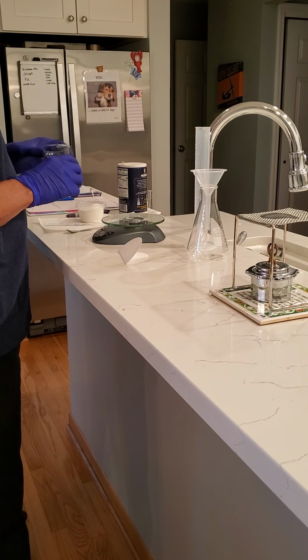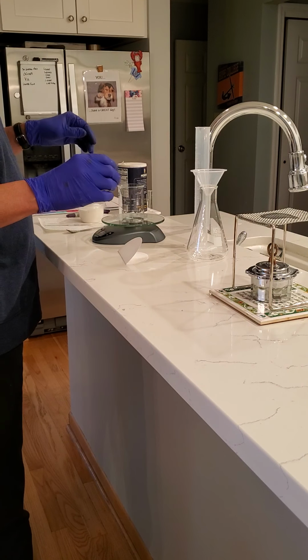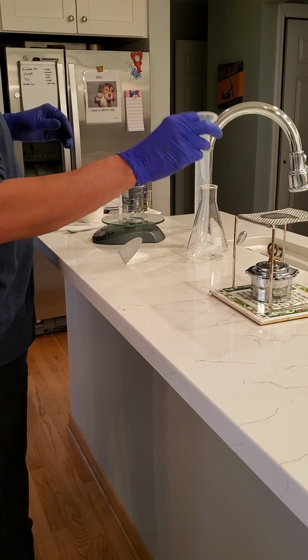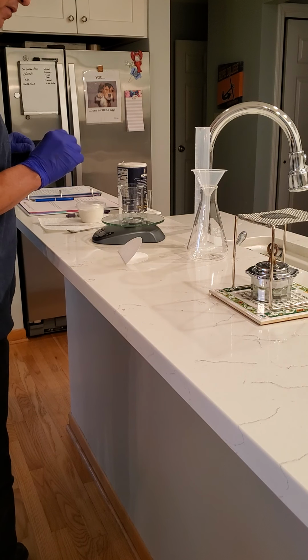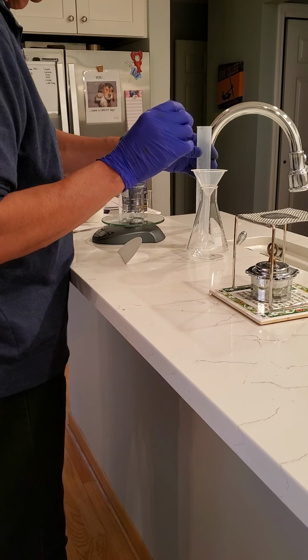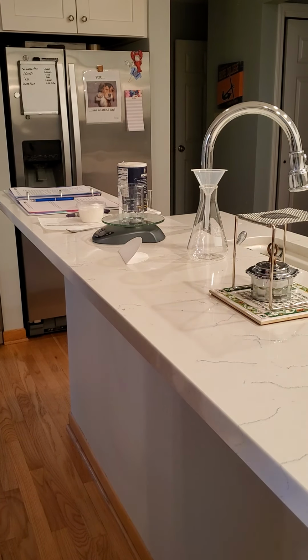So to begin with, we're going to take 50 mils of water and we're going to add it to a beaker, and then we're going to add salt to the beaker. So let me get 50 mils of water.